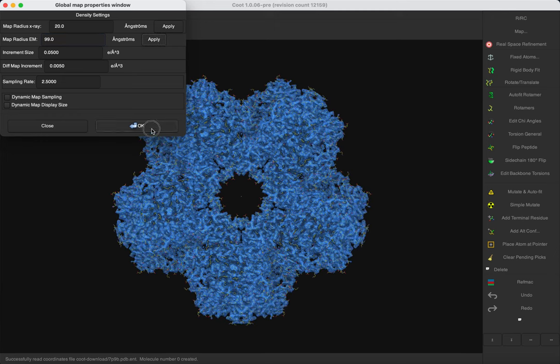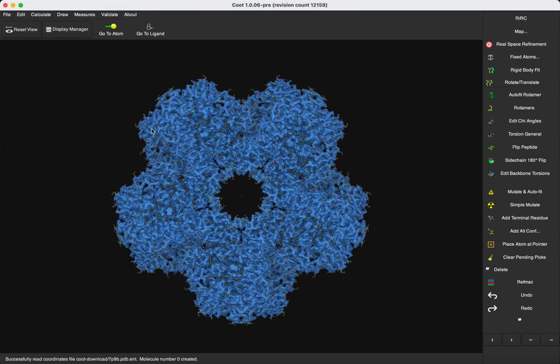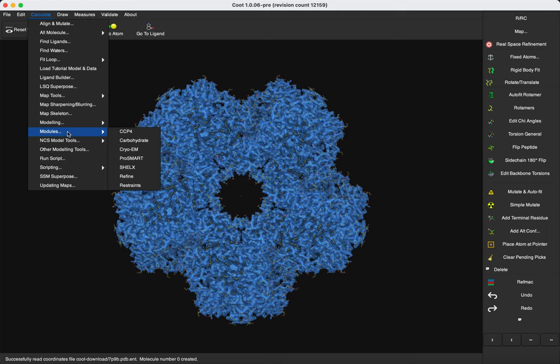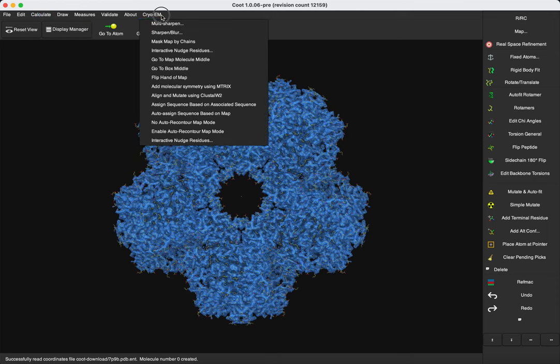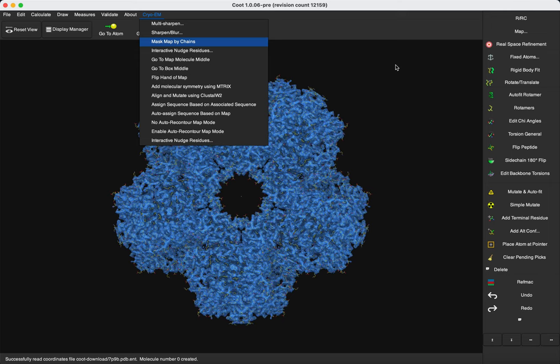As I told you before, this is a decamer, so we have 10 chains, and we want to customize a map for each chain. So the first thing that we are going to do is to use the CryoEM module, and mask the map by chains, so that at the end we can have for each chain a map that we are going to customize.